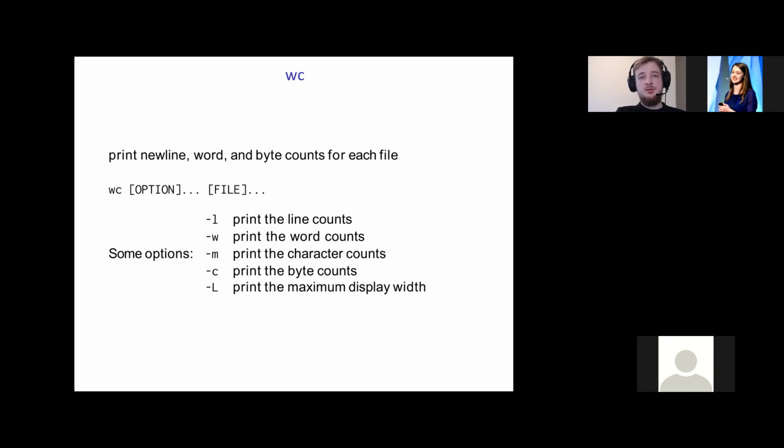We can combine those two commands and calculate how many reads are in a sequencing output file. We need the bc command because each read consists of 4 lines, so we need to divide the line count by 4. We'll talk about Fastq files later.